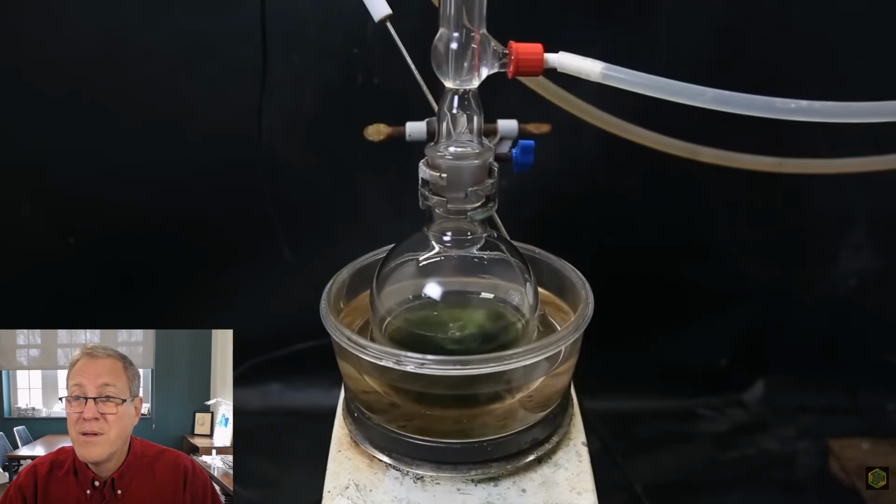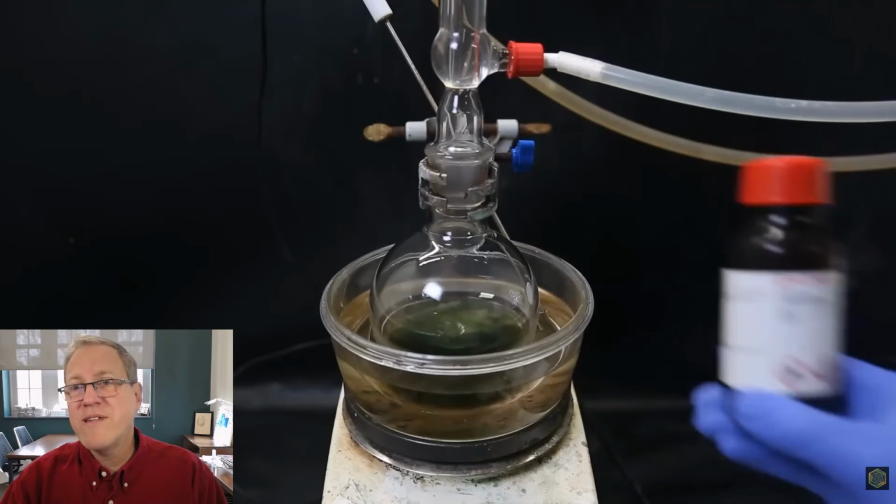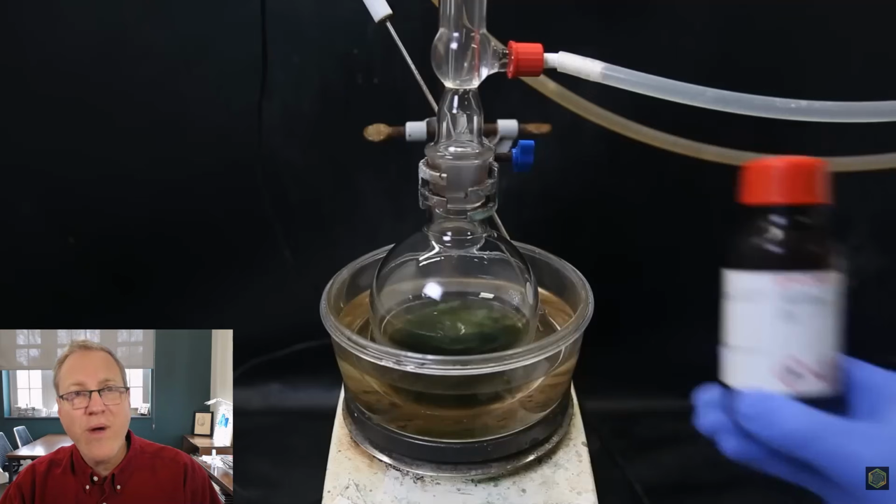Now the next reactant. Tell you what, before he gets to the next one, note he has that probe in the back. That probe is a temperature probe, and it's sticking into that dish that's on the hot plate. So he's keeping track of how hot this is. It's not too hot. It's not too cold. He has a temperature in mind. He hasn't told us what that is, but whatever it is, he's monitoring that temperature.